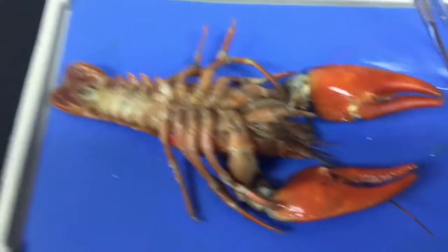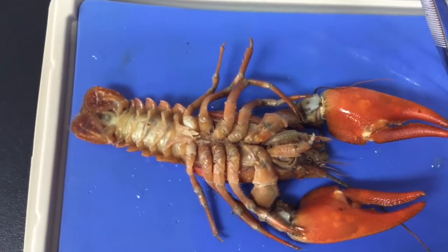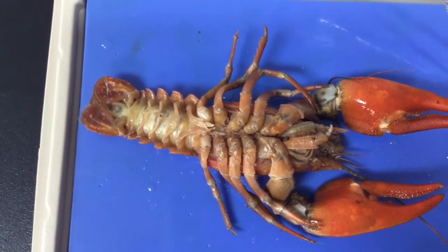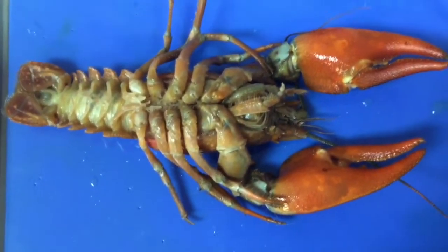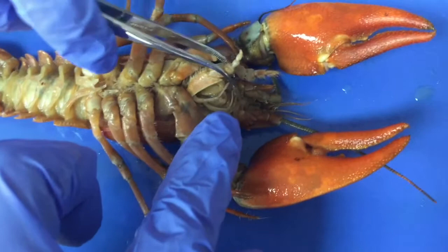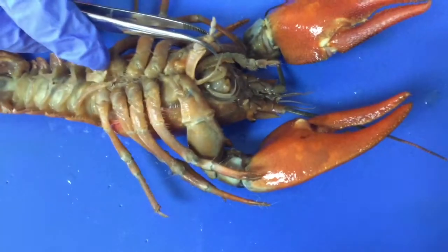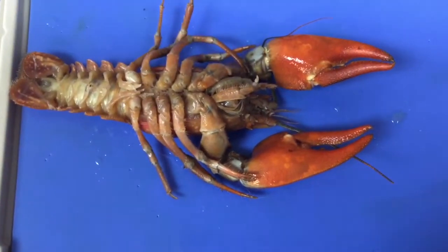All right, we're looking at our crayfish, and by the way, human mouth parts move up and down vertically. Crayfish mouth parts move horizontally. Owen, can you pull back the maxillipeds and show us the mouth parts a little bit better? They move horizontally, side to side. Excellent.